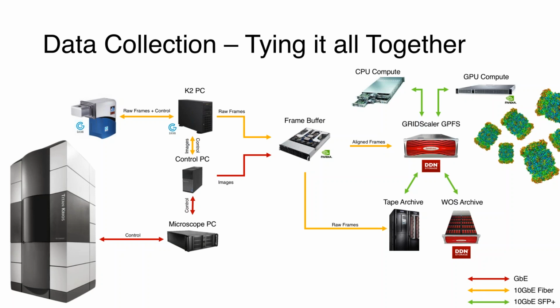The next one is a bit more of a science question. What's the highest resolution you achieved with your Titan setup? Specifically here, I think the highest published resolution, I'm not 100% sure. Looking at the slide that I presented, I think 2.6 angstroms is the highest I surveyed.